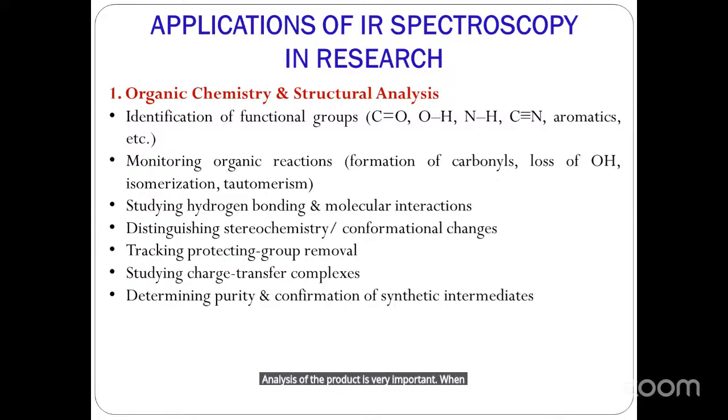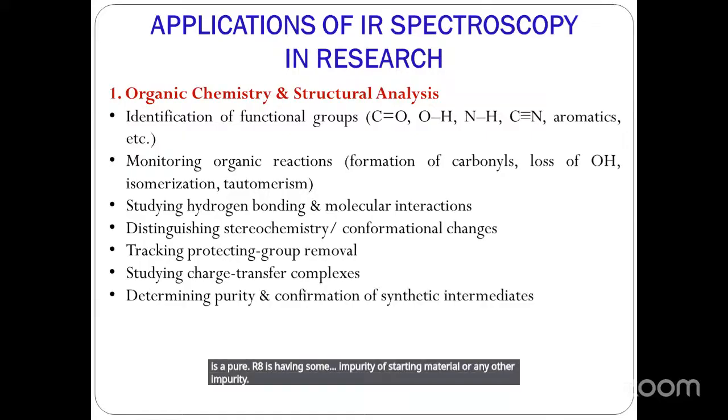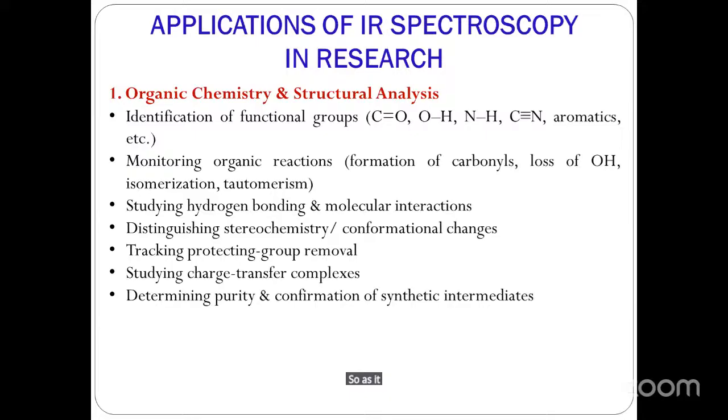When you analyze the organic product within a minute, you can make a conclusion whether your product is pure or it is having some impurity of starting material or any other impurity. As it requires a very short period of analysis, with this IR spectroscopy we can monitor the reactions like TLC.